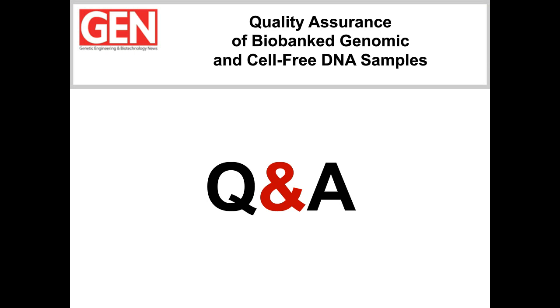Okay. Great. Thanks, Rainer. Next question is for Faye. Faye, one of our audience members asks, I've heard that there is a new ISO standard being developed for biobanks. What are the requirements in terms of QC for this new standard? Yes, so indeed, there is a new ISO standard which is going to be an accreditation standard, and this is developed by the ISO Technical Committee 276. There are, yes, several requirements on quality control for the biological resources in this standard.